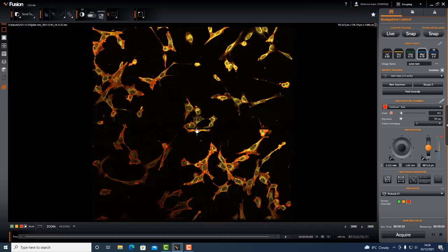If you then went on to stitch the image, we need overlap between each of the neighbouring fields for the stitcher to stitch well and correctly. So this is just a butt stitch at the moment, but display all shows you all of the fields that you capture, whether it's a montage or multi-position, relative to the distance that you've travelled. So that's the image display tools.